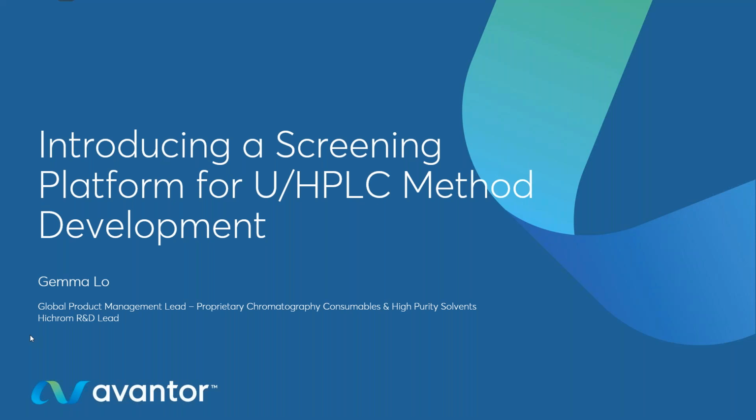So hello and welcome to this webinar. Today we're going to be talking about a screening platform for method development. We're thinking about the parameters to maximize selectivity and really an optimized and systematic approach to method development. So how can we do it more quickly, get a lot of information, and develop good methods within that selectivity space? It builds on what we've talked about in the previous two webinars. If you haven't watched them, you can go back and watch the recording. If you have, then you'll know from the start what I'm talking about.